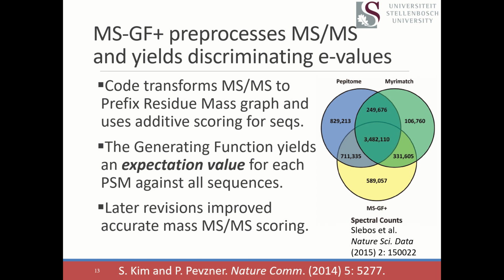So when you run a BLAST search, if you get an e-value of 1, that means that by random chance you would have expected the best result to be exactly this good. You want that to be nice and low to suggest that under no circumstances would a random search have produced a hit this good. Yeah, good question.